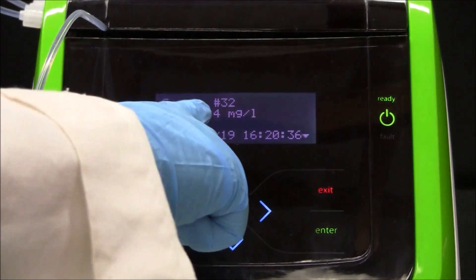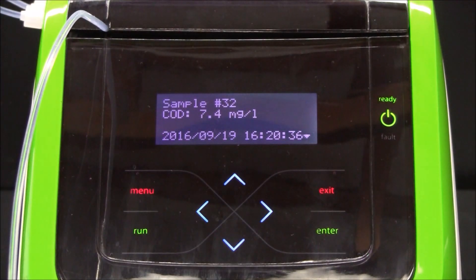After approximately 15 minutes, the COD value will be displayed.